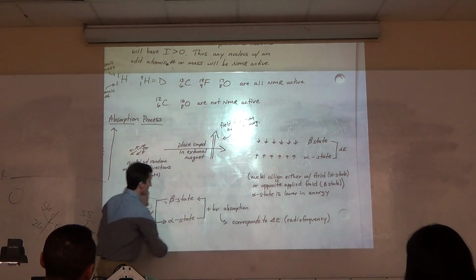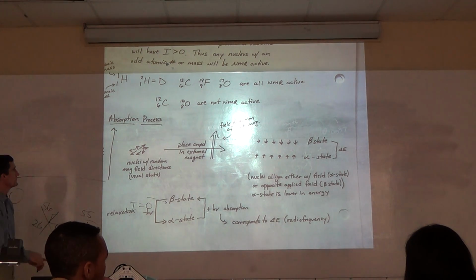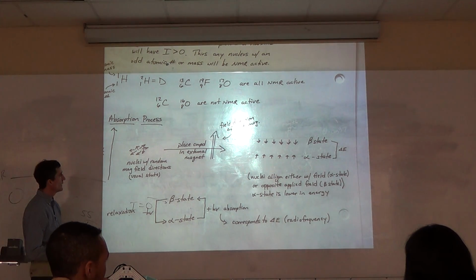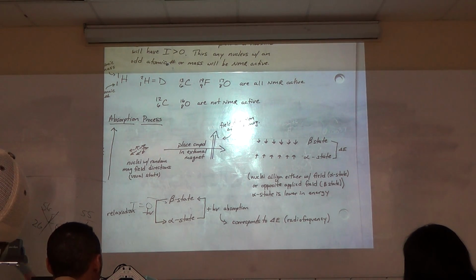Okay, why do we get a signal? How? Okay. Now let's say we're doing proton NMR. Let's say I've dissolved a compound that has lots of different protons, like we looked at the very beginning. Okay? And it's got maybe 4 types of protons. Okay, we did that. Thus it has hydrogen nuclei. Okay? Maybe in each molecule there's 12 hydrogen nuclei.